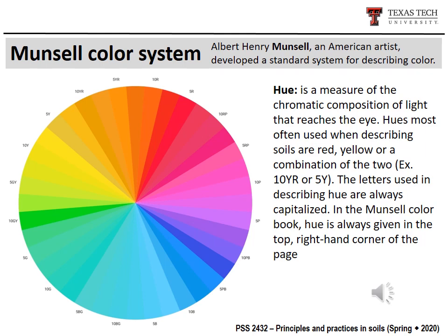Okay, and in soil science, if you look at this color picture, it's very common the region between 5Y clockwise until 10R. Okay, this is the Munsell color system.